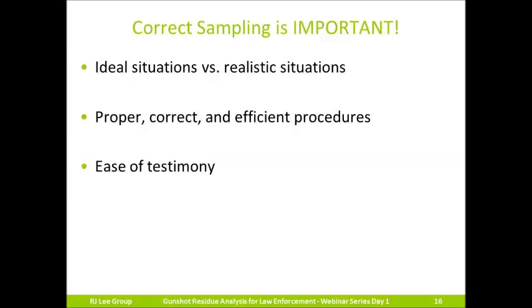This is because of all the factors that I went over previously. Let's say weather, motion activity, time, washing, etc. Because of these factors, you want to make sure that you are collecting any and all potential particles that could be present to be collected. Therefore, we want to make sure that you're sampling correctly and efficiently. By sampling properly, not only are you ensuring that you are collecting any and all particles present, but you are also ensuring an easier time testifying. You can say under oath that you have sampled correctly and appropriately based on the standards set forth in the field.